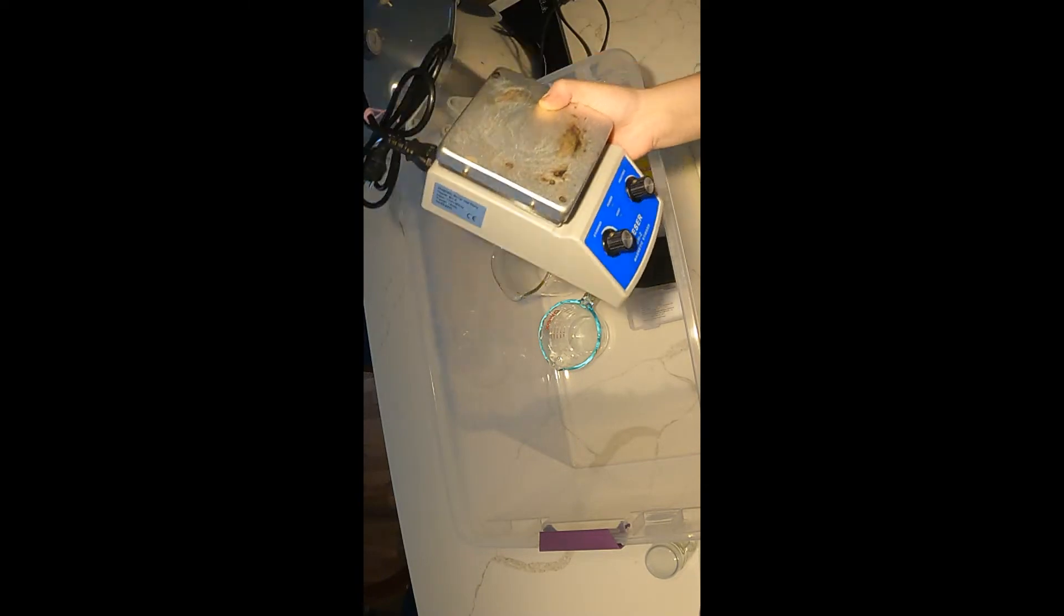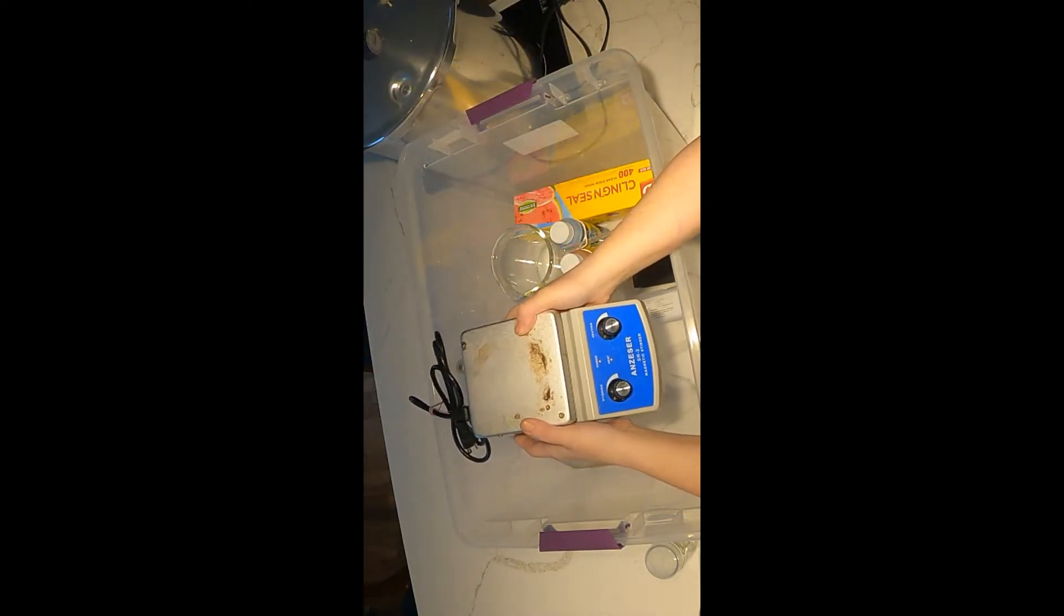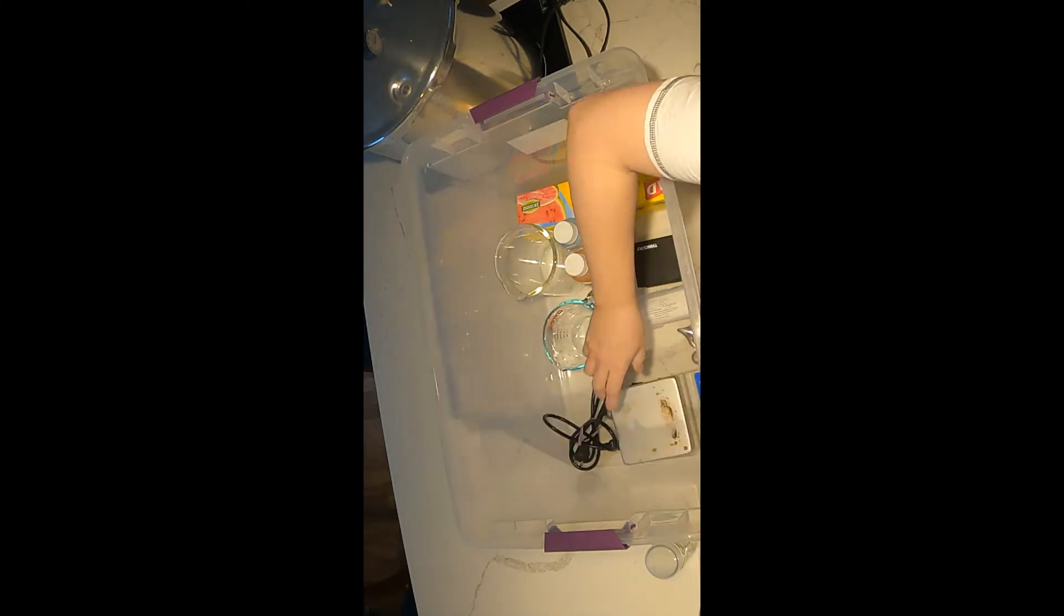I feel that a stir plate is absolutely essential. I don't see any other way to evenly stir your media. It's definitely a need and once you have one of those, you need the stir bar to go with it so that you can actually stir your media.